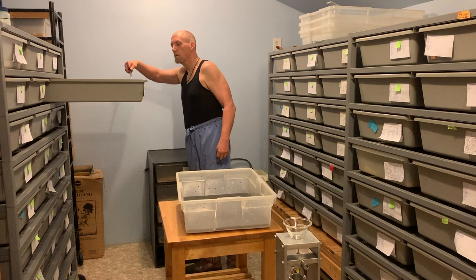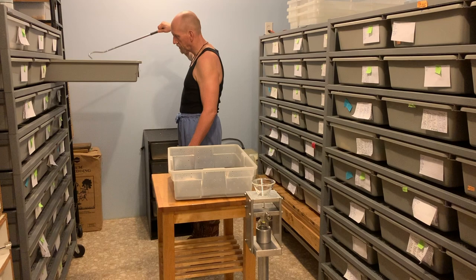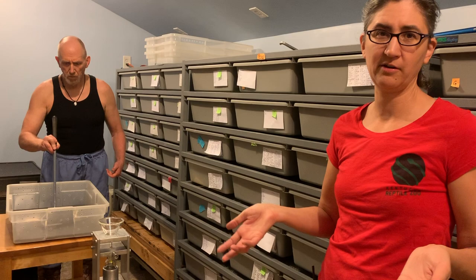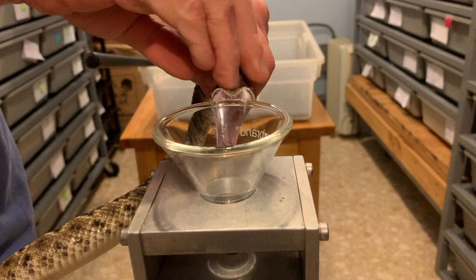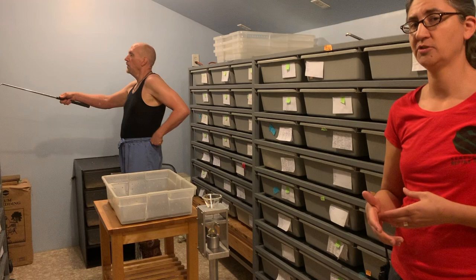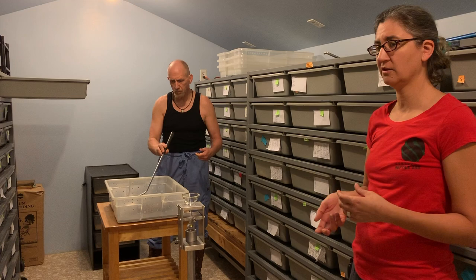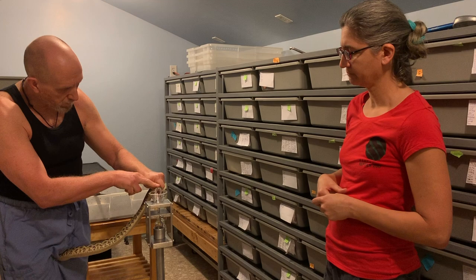One other question we're asked frequently is how often we extract from the snakes. It's important to realize that the snakes do have venom at all times — even after Jim is finished extracting from one, that snake still has venom. It does not give all of the venom that it has during the extraction; we're getting maybe about a third of the venom contained in the glands. So it still has venom and could still envenomate Jim immediately after extraction. Because the process is stressful and some components take a little bit longer to be produced, we give them at least a two-week break between extractions — that's the absolute shortest amount of time. Some species go three to four weeks between extractions.